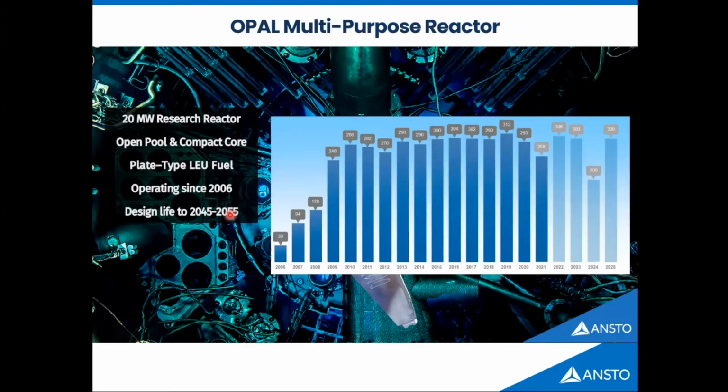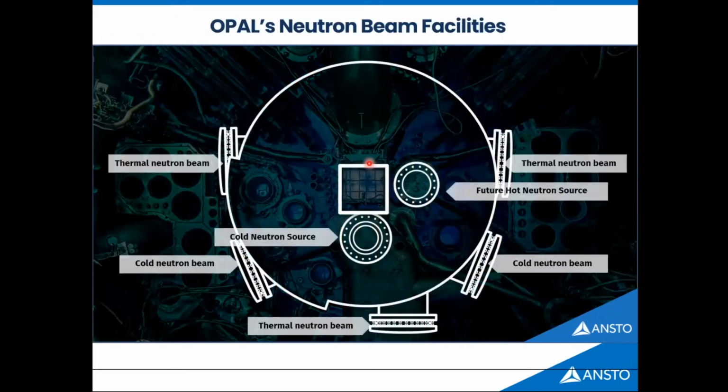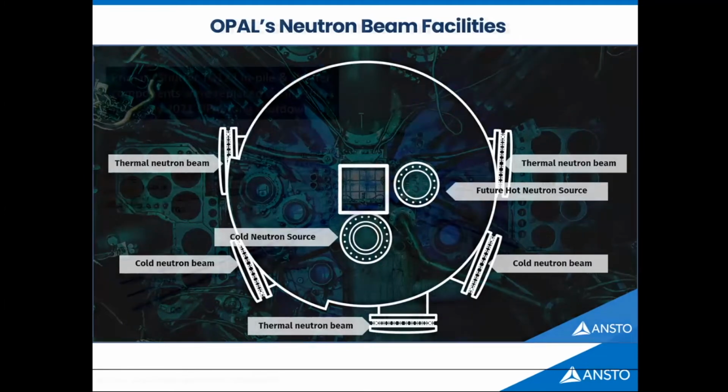And we are very ambitious in terms of the request for this reactor to run. It's about 300 days per year. I mean, those of you who work as instrument scientists can imagine what that is. So that's pretty intense, and for some time it's been going like that. Of course, there have been some drops from time to time for different reasons. The cold source was not behaving and so on. But 300 days is quite intense. Right, so now going back to a bit more science.